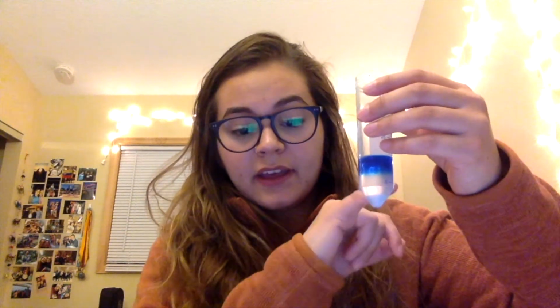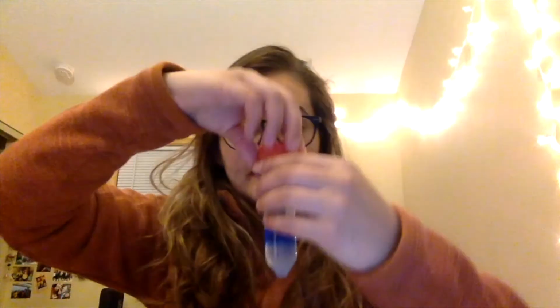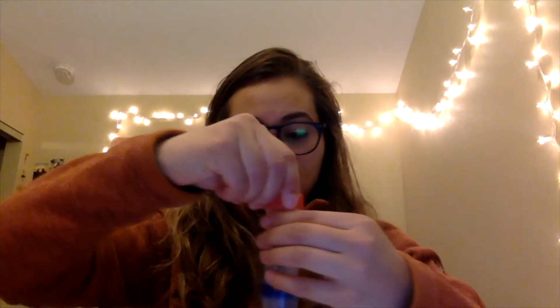So now that we've added the alcohol, our DNA is going to start to solidify, and you're going to start seeing some white threads at the edge of the ethanol and the DNA sample after a minute or so. So just give it some time, and we'll look at the results in a couple seconds.